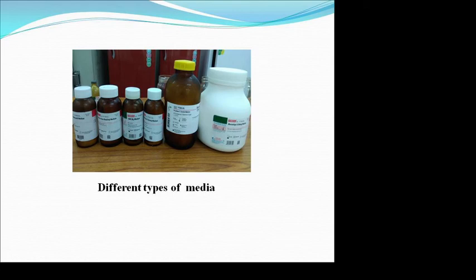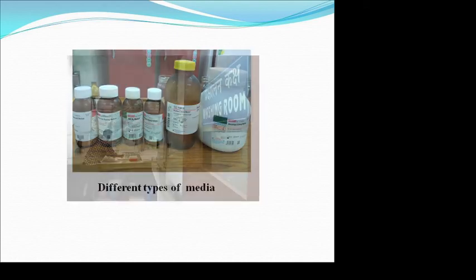Basically it's an MS medium. Now there are different plants, and they require different types of medium. Here I'm not discussing that. In subsequent lectures maybe we can take up those topics.